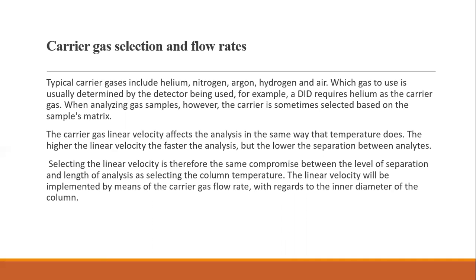Typically, purities of 99.995% or higher are used. The most common purity grades required by modern instruments for the majority of sensitivities are 5.0 grade, or 99.999% pure, meaning that there is a total of 10 ppm of impurities in the carrier gas that could affect the result. The highest purity grades in common use are 6.0 grade, but the need for detection at very low levels in some forensic and environmental applications has driven the need.